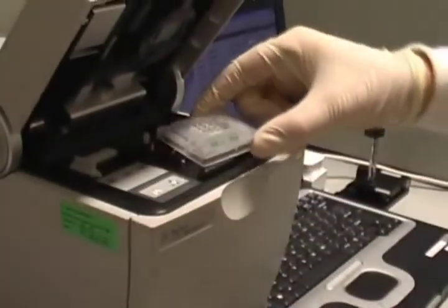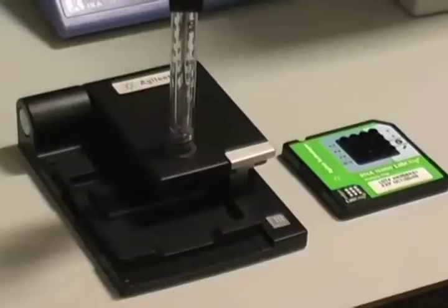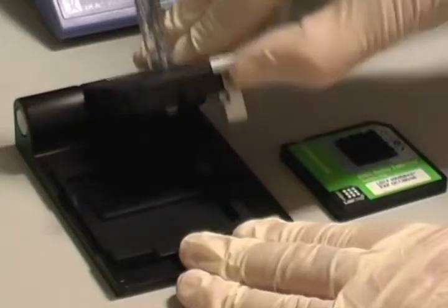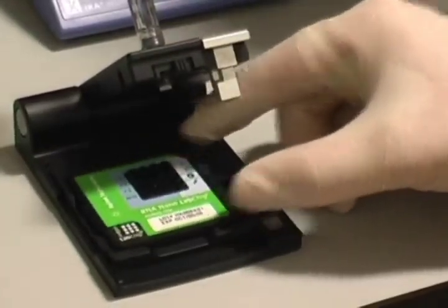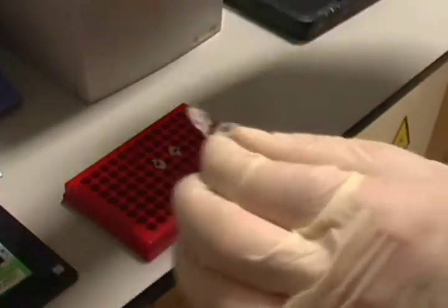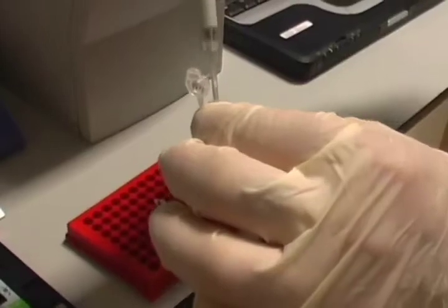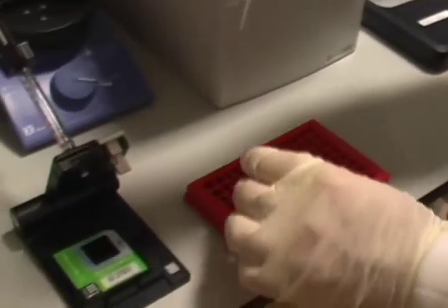The bioanalyzer is used to determine sample quality by monitoring the RNA as it passes through a microfluidics-based gel electrophoresis chip. The chip is primed by adding gel to the wells.